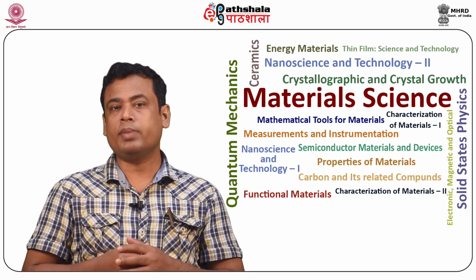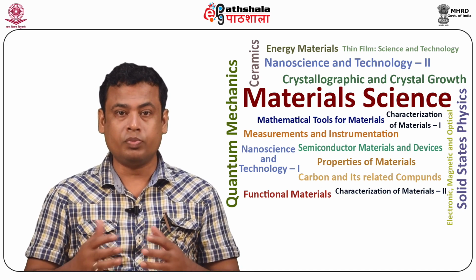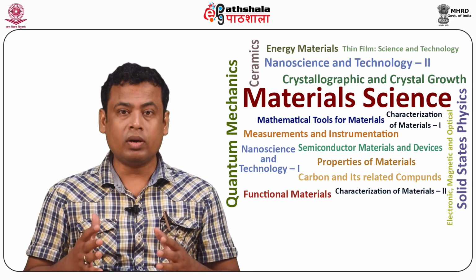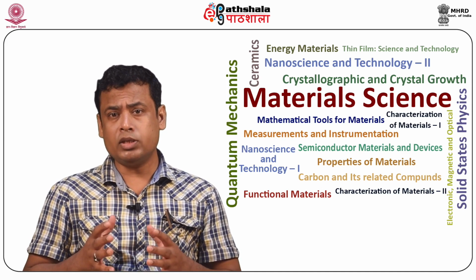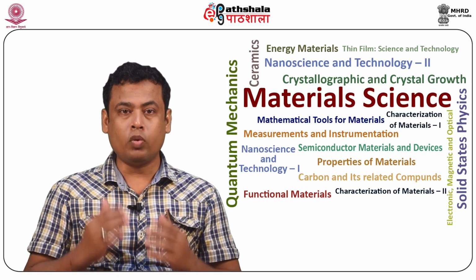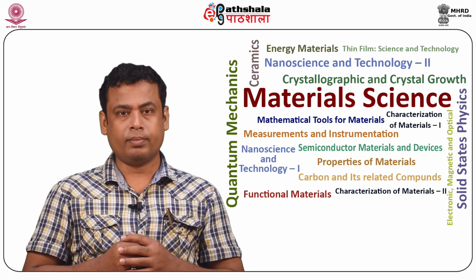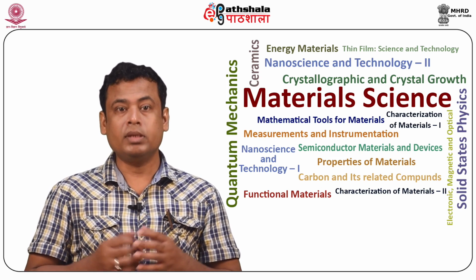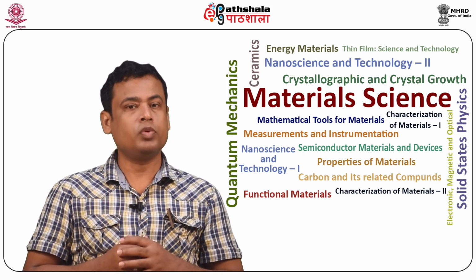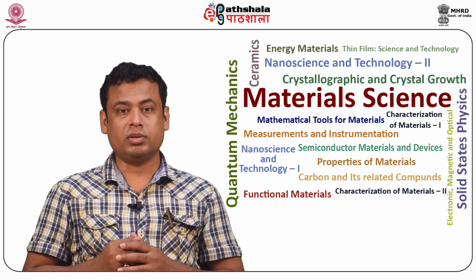Key in such measurements is to separate the short range van der Waals forces from the longer range electrical or magnetic forces. A lifting mechanism enables the probing of longer range electrical and magnetic forces and deconvoluting them from the short range van der Waals forces that are present during topographic imaging.